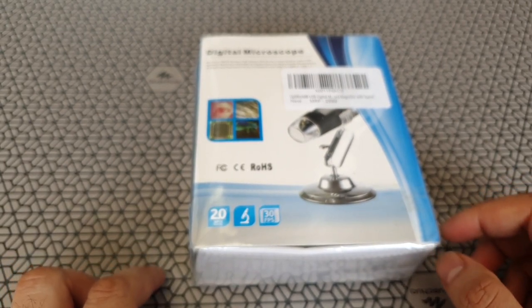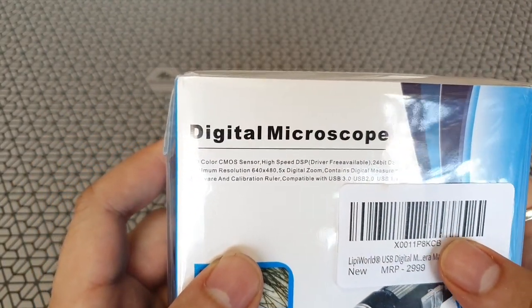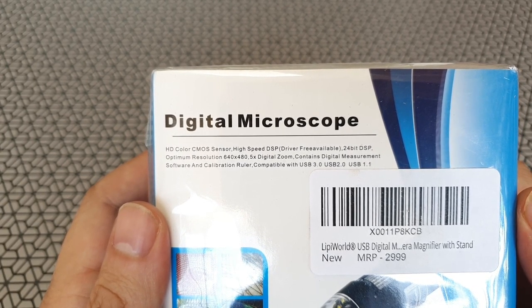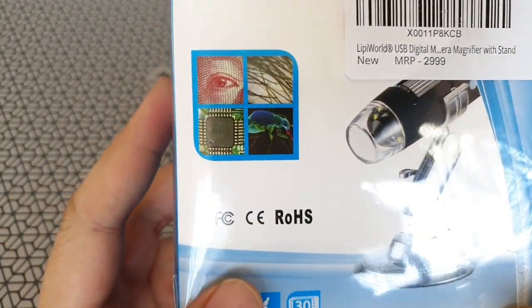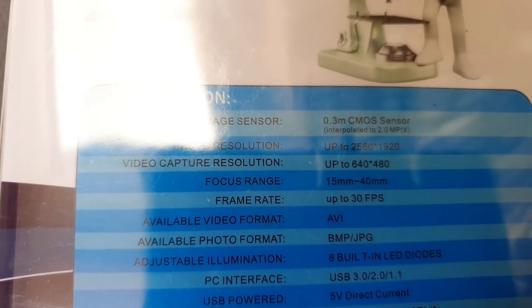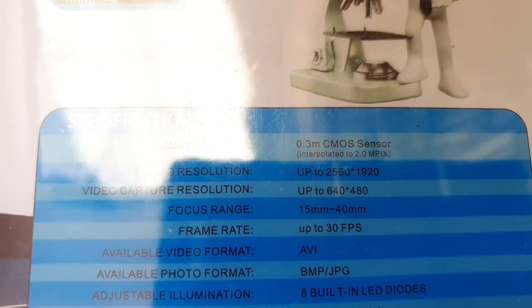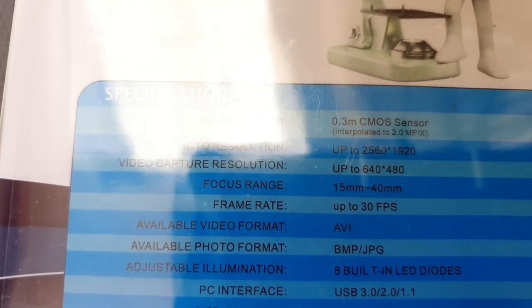It's portable, has 8 LEDs, and uses an endoscope camera magnifier with stand. It uses USB to transfer images and gives you a display. It has a CMOS sensor that captures pics at about 2560x1920 pixel resolution. It captures video as well at 640x480 up to 30 frames per second. It's got a 15mm to 40mm focus range and 8 LEDs to help brighten the subject.